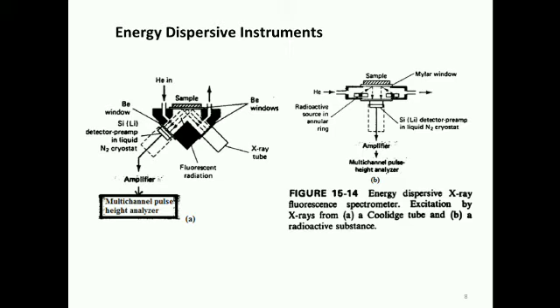In multi-channel energy dispersive instrument, all of the emitted X-ray lines are measured simultaneously.